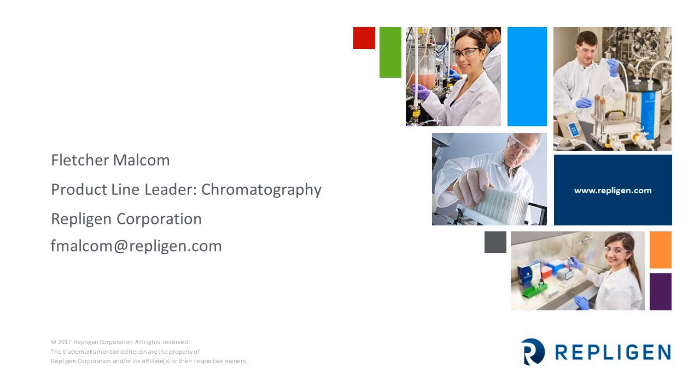Right, so why might you see differences between a small column and a large column? It's a question that we get quite frequently. A lot of the time, what we find is that some of the differences may be due to the chromatography systems used, the volumes associated with those systems. And so oftentimes there's a system aspect to differences in using small columns to large columns. And then from a chromatography column perspective, there are differences in terms of how the wall effects of the column help to support the packed bed. And that can influence characteristics like pressure flow. We sometimes see differences in plate count asymmetry as well, but that's resin dependent.